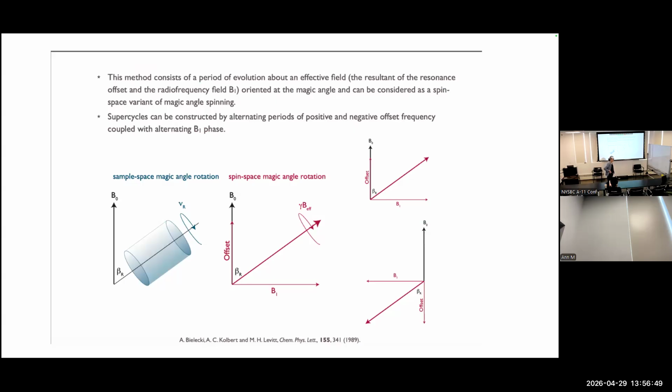So you turn on the CW pretty high, but you put it off resonance by a number you calculate, so that all the spins are basically doing magic angle spinning in spin space. And it really works pretty well. You can get some nice proton spectra. Again, you'll have a scaling factor. You will not get a normal chemical shift scale.